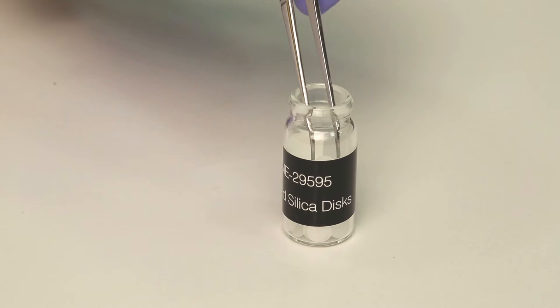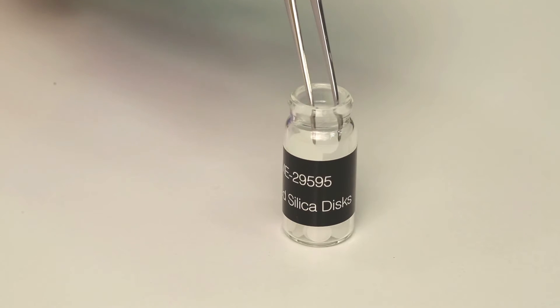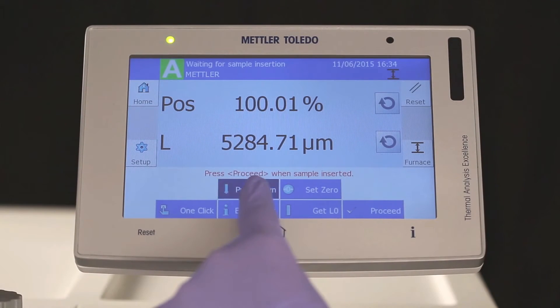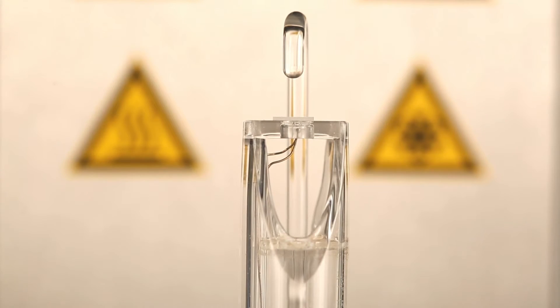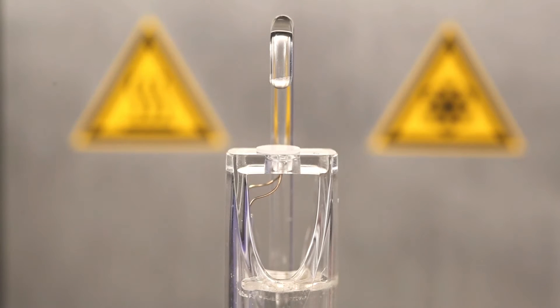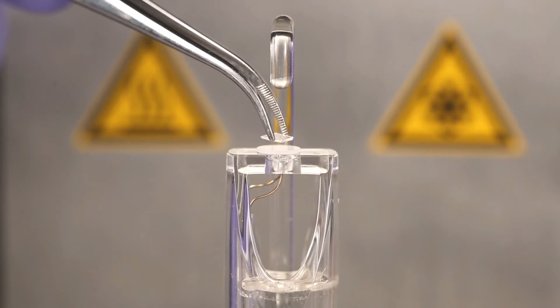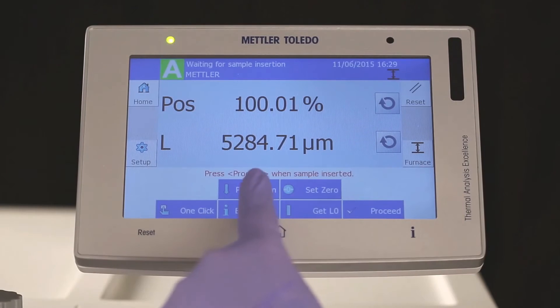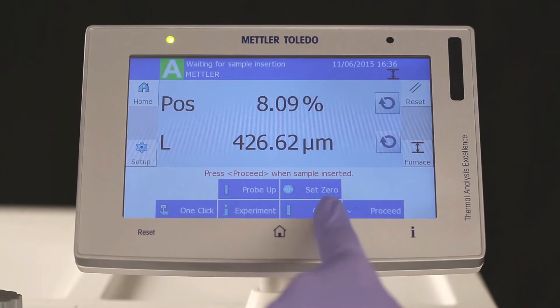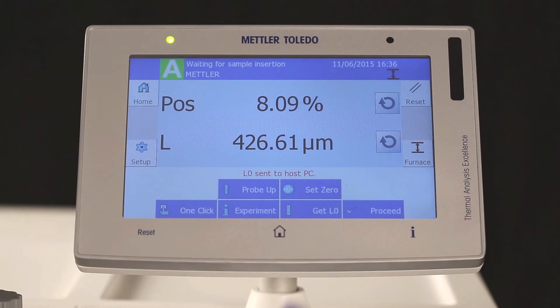Sample preparation for a penetration measurement is equal to that for dilatometry. Put a fused silica disc on the sample support for protecting it from contamination. Make sure that the probe is in zero position. Lift up the probe and place the PET sample onto the sample support. Lift the probe down so that the 3 mm ballpoint probe is in direct contact with the sample. Press Get L0; the initial length is sent to STARe software.